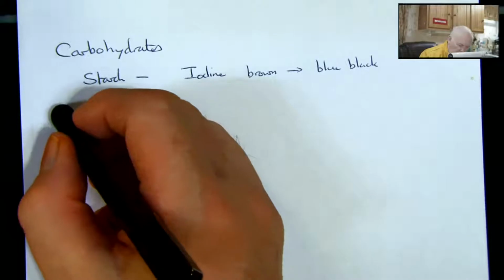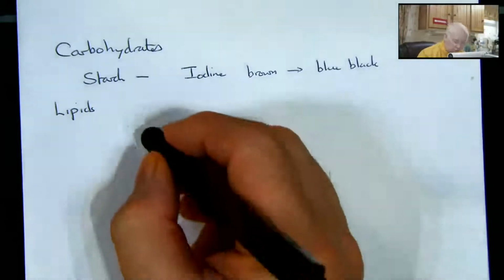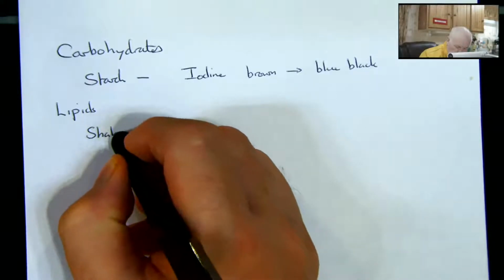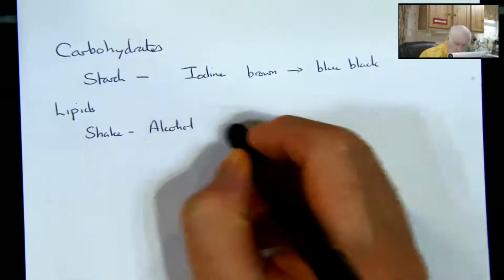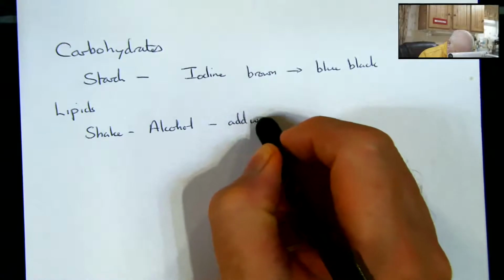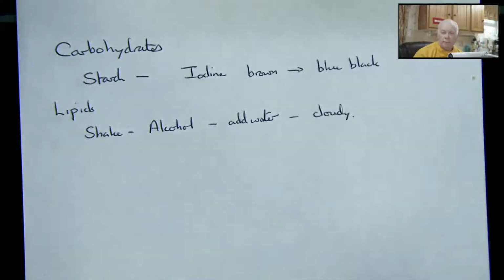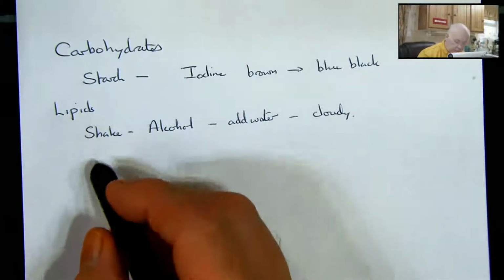We're going to test for lipids, fats. The test for this is we normally shake with some alcohol, and then we add water. And we're looking to see if something goes cloudy. And if it does, then we've got some fat or lipid present.